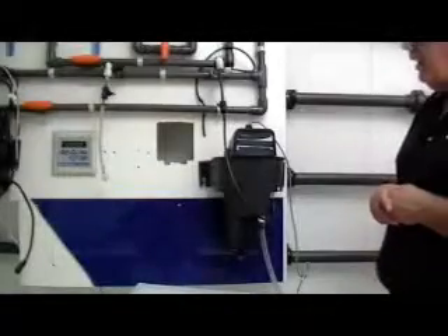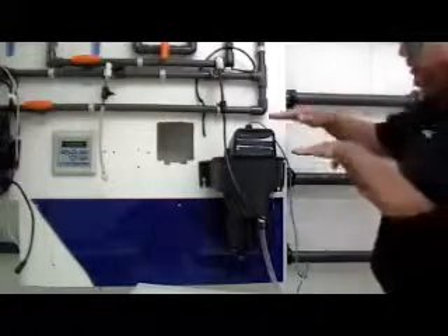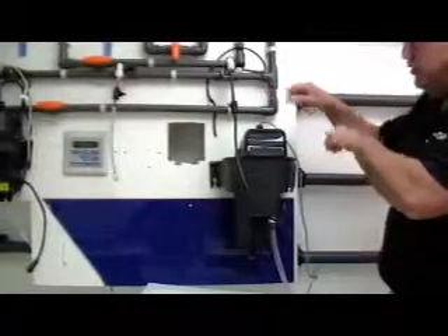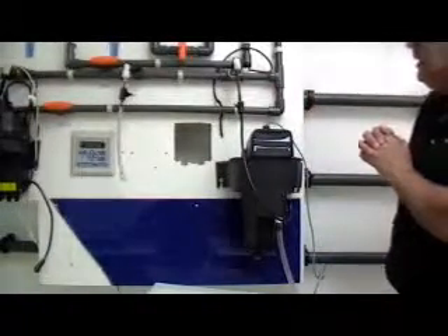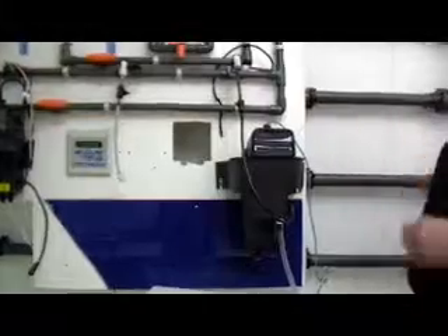Mounting the 4150 to the wall, there are a couple of things you should take into consideration. One, you want to make sure that you have at least 8 to 10 inches or 20 to 25 centimeters clearance above the instrument for calibration and routine maintenance. Two, the turbidimeter should be mounted as close to the sample point as possible, no more than 6 to 10 feet or 2 to 3 meters.